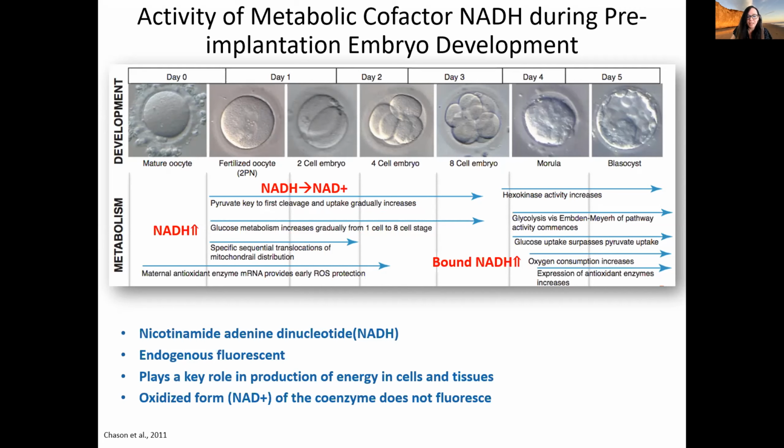So could we look at the ratio between free and bound NADH to see the different stages within the embryo development? NADH is an autofluorescent molecule.